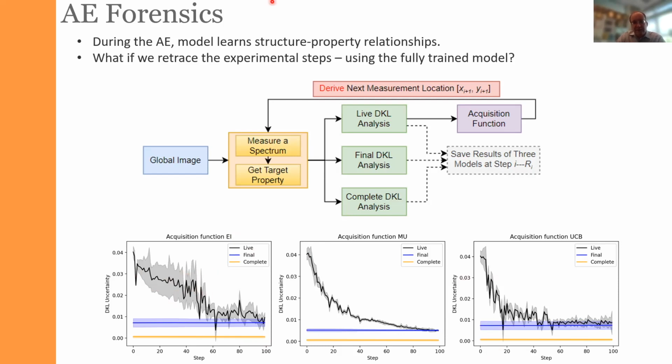So it takes a little bit of time to learn how to interpret these curves. But once you do, this is something that is available during the experiment, meaning we can use it for real-time monitoring of the learning process during the deep kernel learning process.